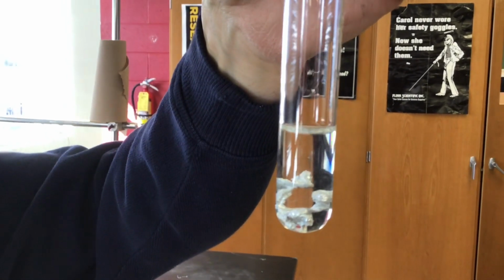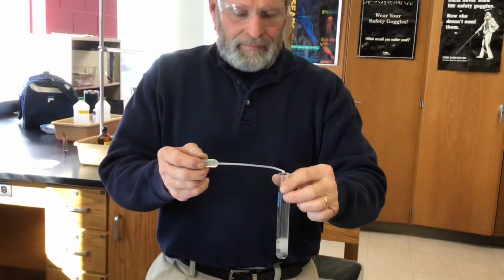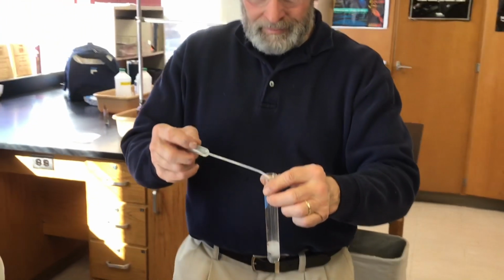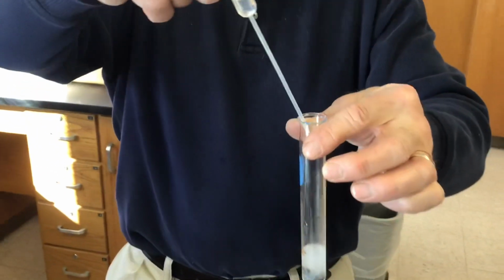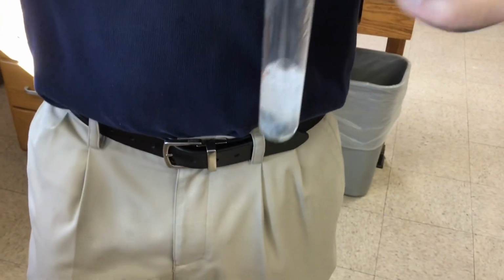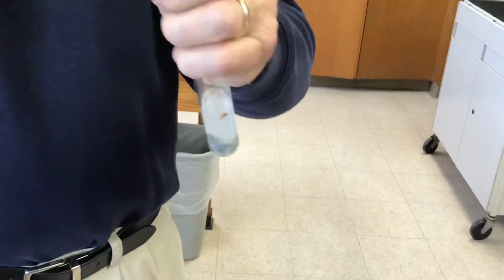I was expecting it to start reacting right away. Yeah, I think I'm going to have to stop the camera here, and we'll get a more concentrated HCl. We're not doing so great, so we've gone to the big boy here. We went right to the concentrated bottle of hydrochloric acid, and Mr. Hevel has a dropper full of it, and we're just going to spike this thing, put some even more concentrated HCl in. Now, I'm hoping the bubbling goes up. Looks like it did, didn't it? I think we've got nicer bubbles.